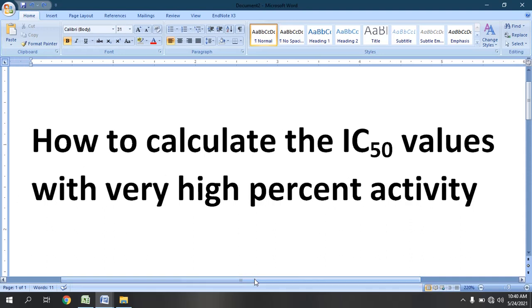Bismillahirrahmanirrahim. This video is in continuation with my previous video on IC50 calculation. In this video we will learn about how to calculate the IC50 values with very high percent activity — that is, when the activity of the sample is higher than 50 percent.